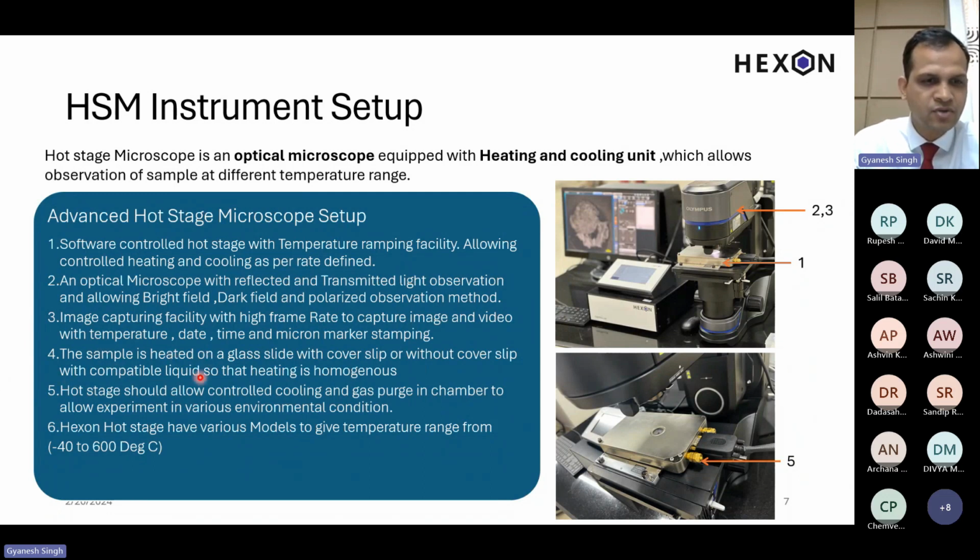Once that is studied, you can also use relevant liquid, or cover slips if fumes are there. So this is the way we can place the sample.